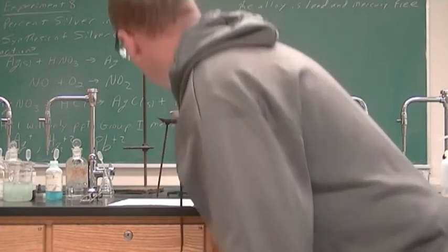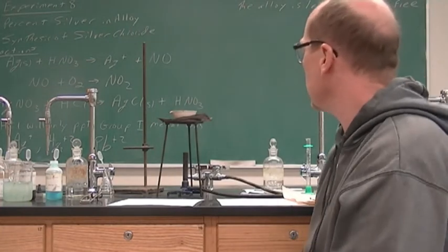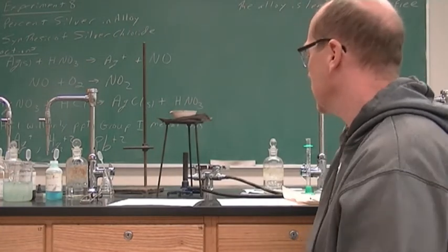All right, I'm going to let that cool down and get a mass, and then we are done.